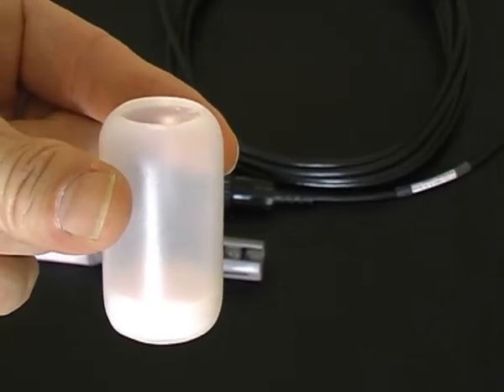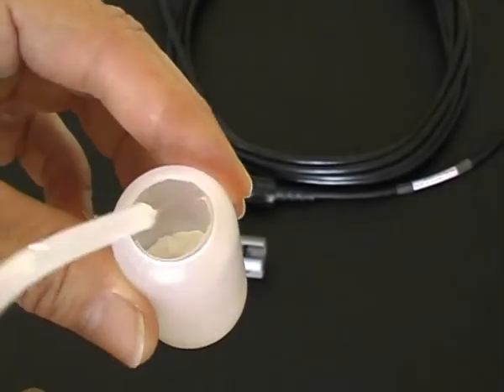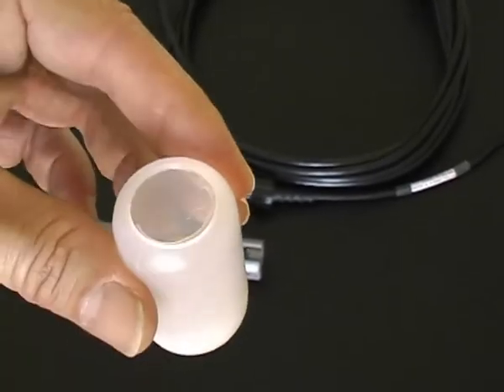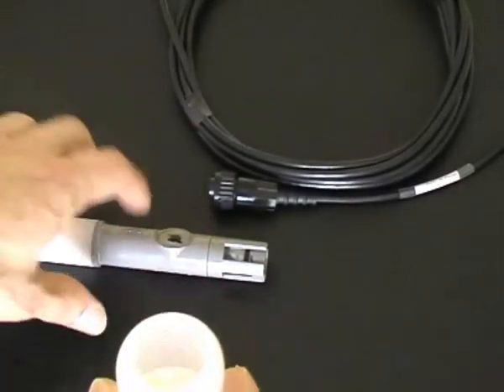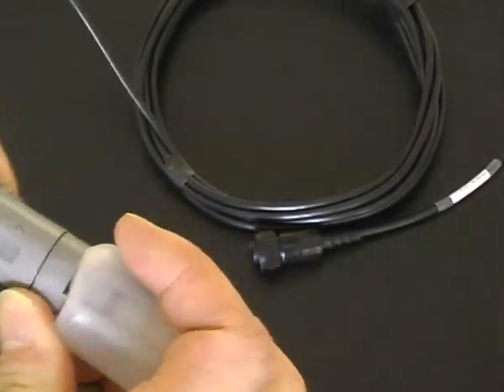To store the dissolved oxygen sensor, place a sponge in the bottom of the wetting cap and moisten it with water. Place the wetting cap on the sensor and store.